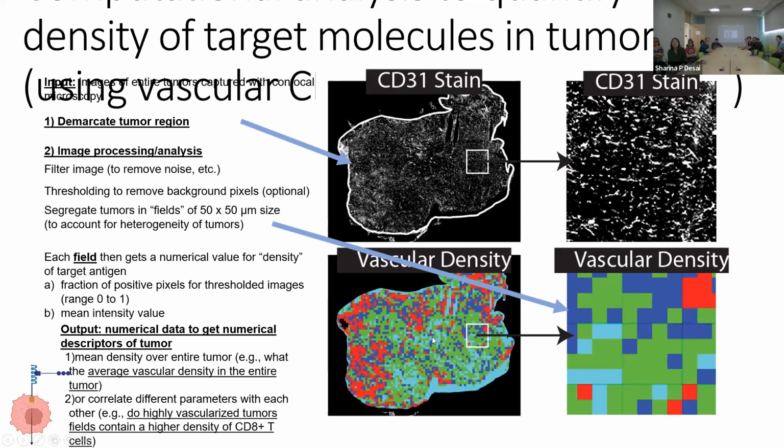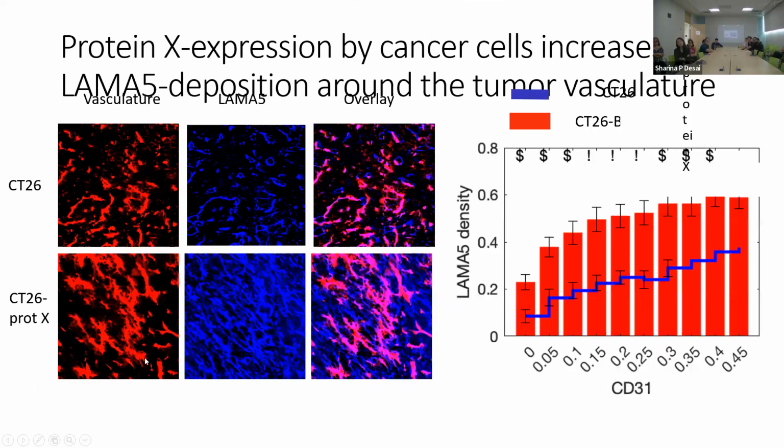We know a tumor is usually heterogeneous, so you see some areas with more vasculature and some with less. Then you can do this whole thing for multiple channels, and doing four channels is really straightforward with the microscope. The colors are available with minimal overlap, so you can very easily do four channels. If you want to do more, it would get tricky, but for a lot of questions, four colors is a lot.